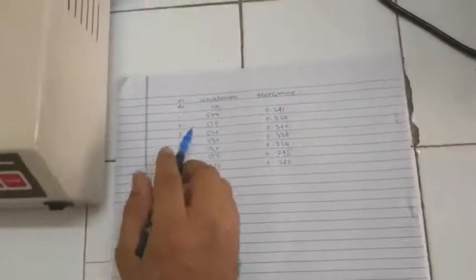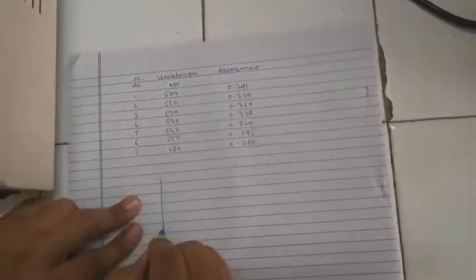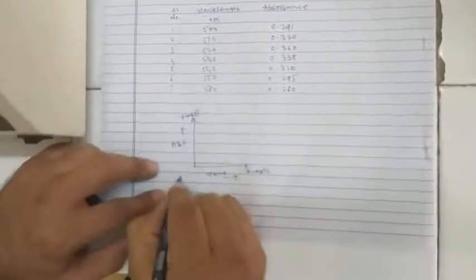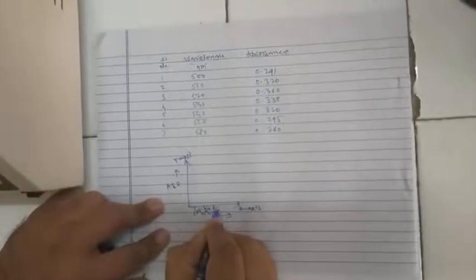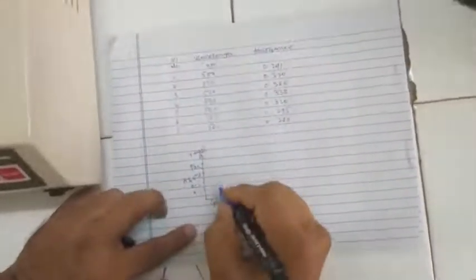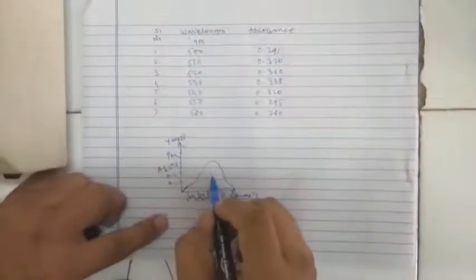I have done scanning of the sample from 500 nm to 560 nm and we are getting absorbance values from 0.29 to 0.260. Now we have to draw a graph of absorbance against wavelength — absorbance on the y-axis and wavelength on the x-axis. Here is the origin. We have scanned wavelength from 500 nm, with absorbance values of 0.1, 0.2, 0.3, and 0.4. From the plot we can see the maximum wavelength is at 520 nm.